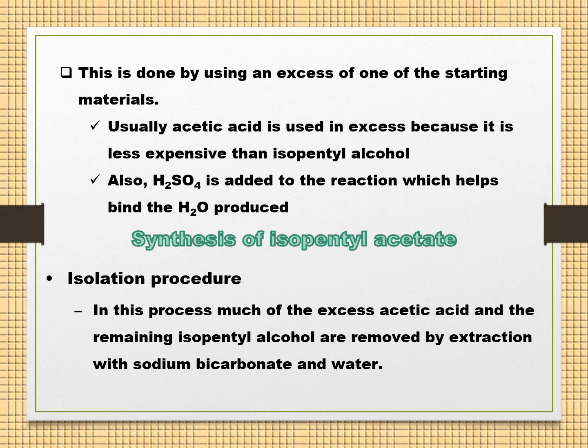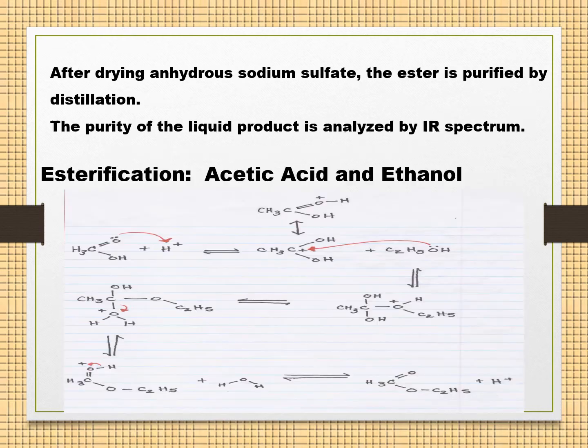Specifically, sodium bicarbonate should remove any excess acid or alcohol remaining in the reaction flask.